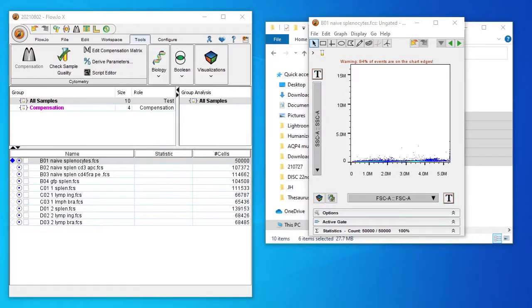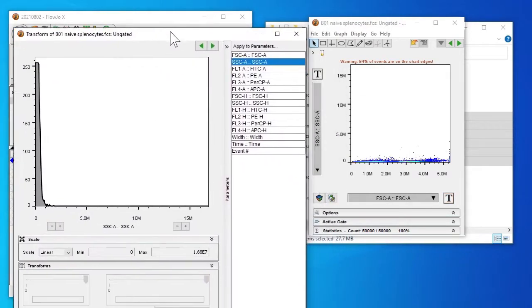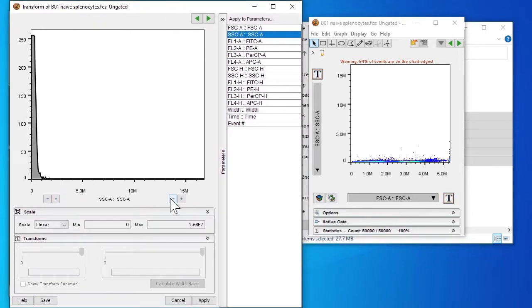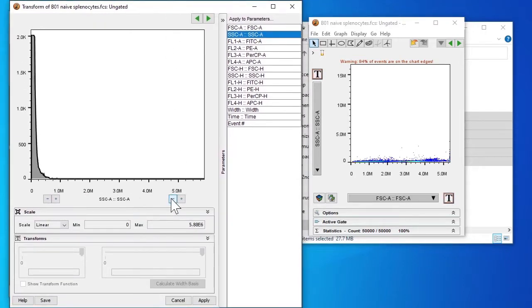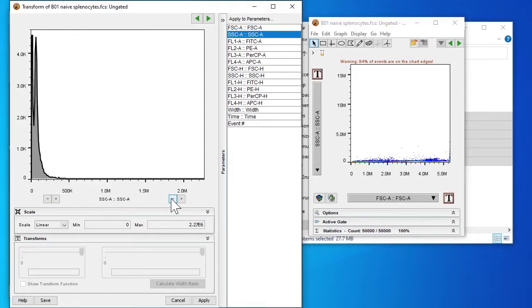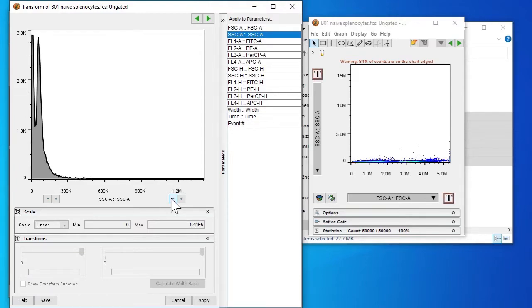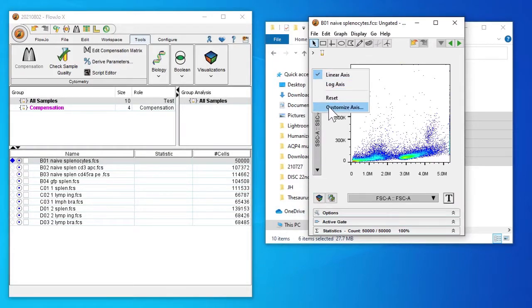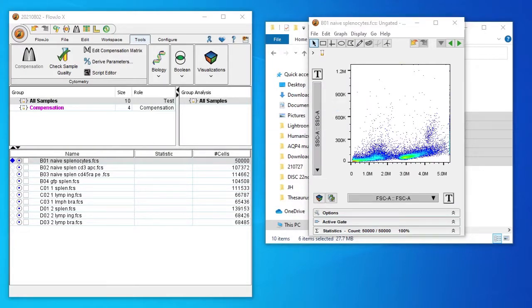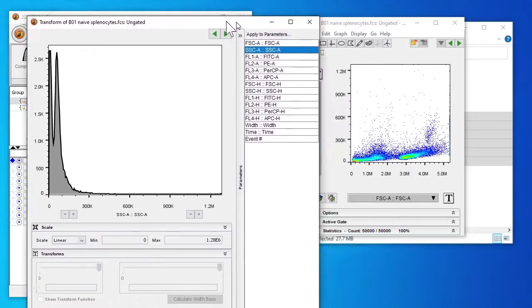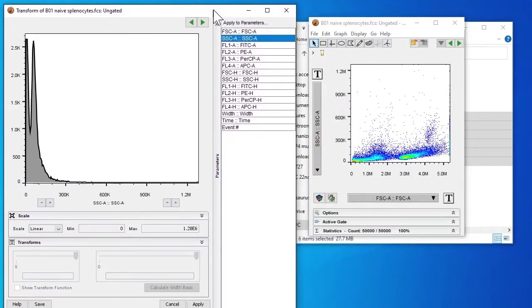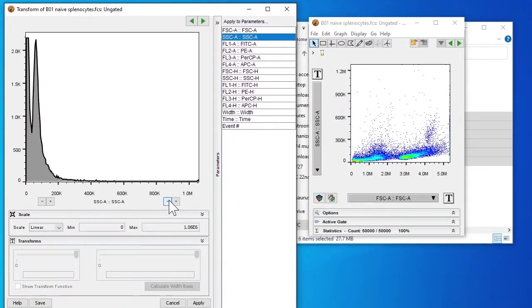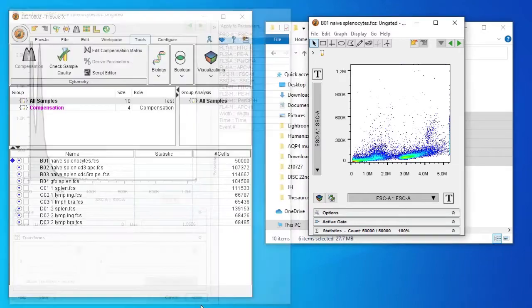And I'll also do the same for the y-axis. Again with the minus button. I'll just change it a little more.